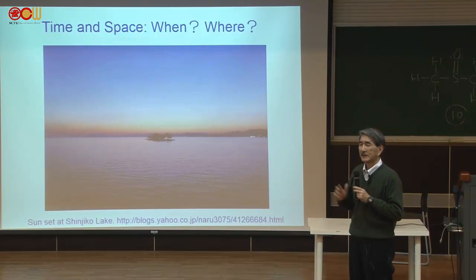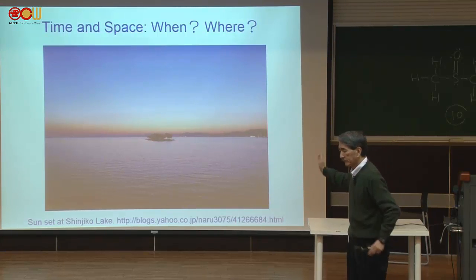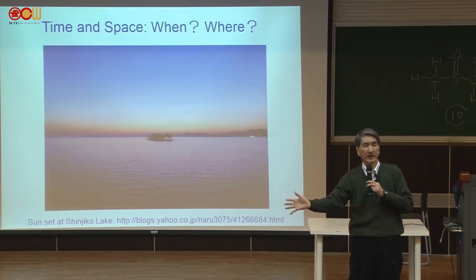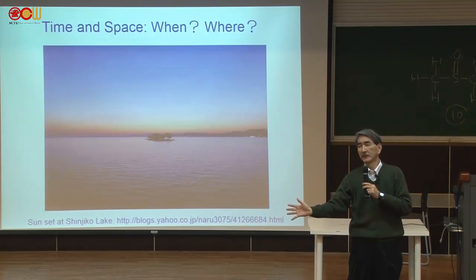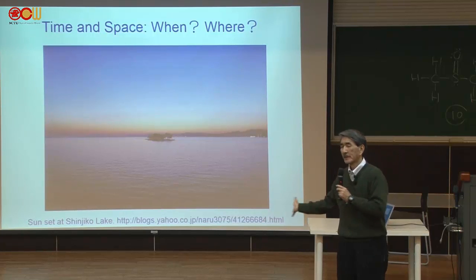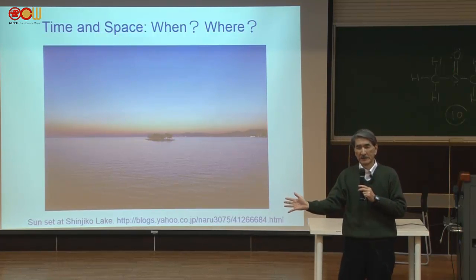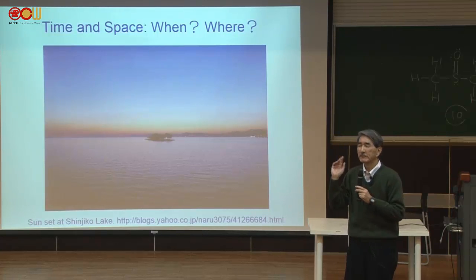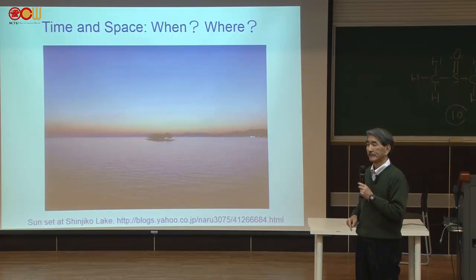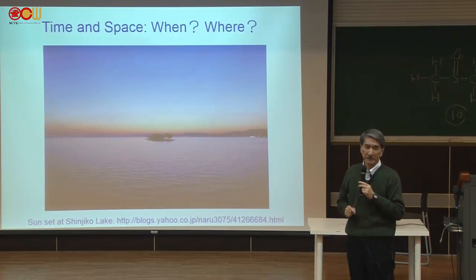And as I said, I like to play tennis. But if you want to play tennis better, you want to see how you hit the ball. And if you hit like this, and then you see the face of your racket properly or not, then you can tell if it's good or not. So that kind of stopping motion is very crucial. The same is true for the molecule. So we want to see the molecule in stopped motion by time-resolved Raman spectroscopy.